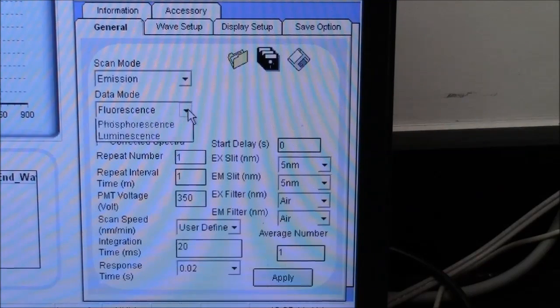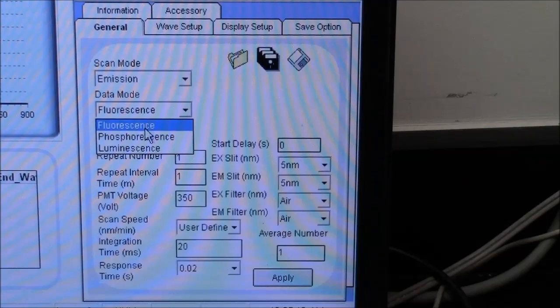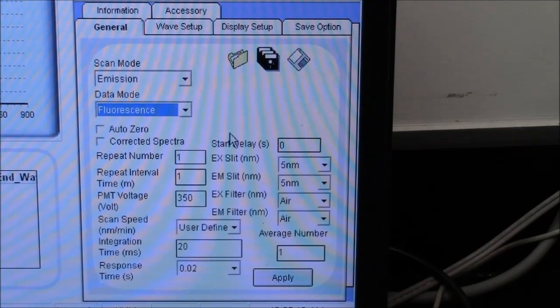Data mode, fluorescence. Some reactions make their own light, in which case you would do luminescence, but this is a fluorescence measurement. The most important control here is this PMT voltage.